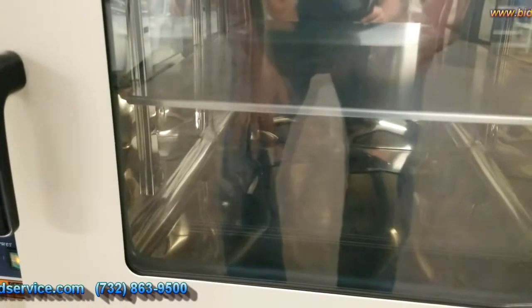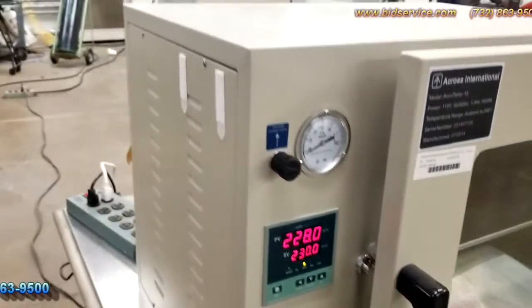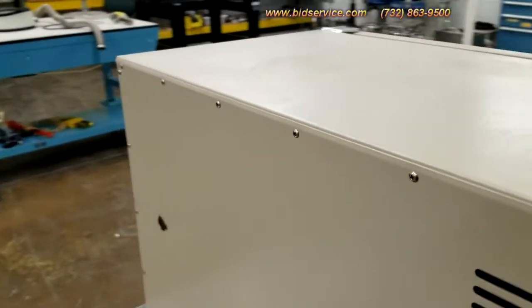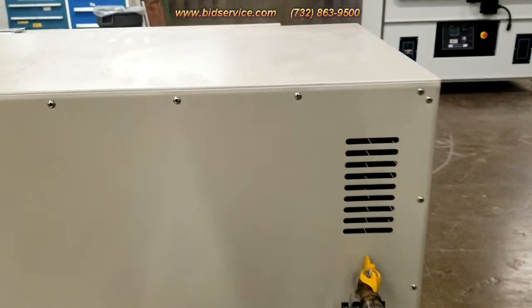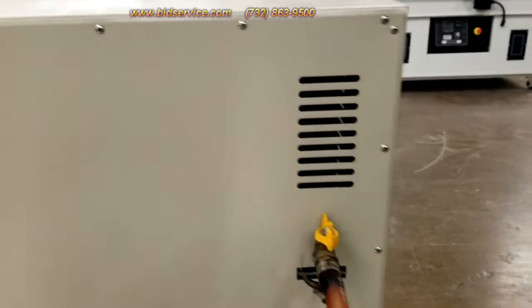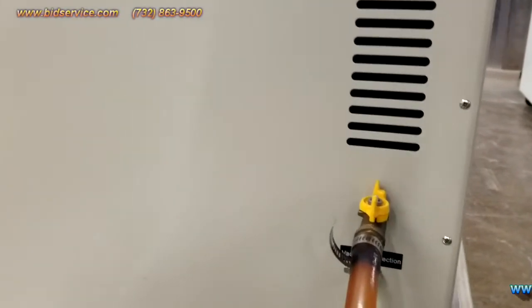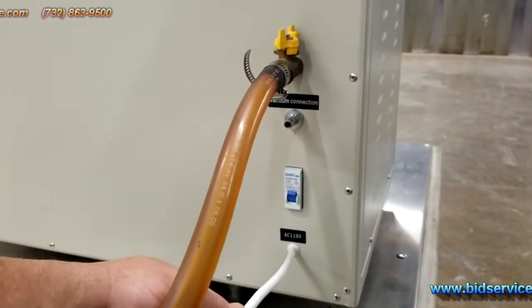Here's the inside of your chamber. On the back, you have your vacuum port and then you have your vent line here. You've got your main breaker, and then you've got your power cord right here.